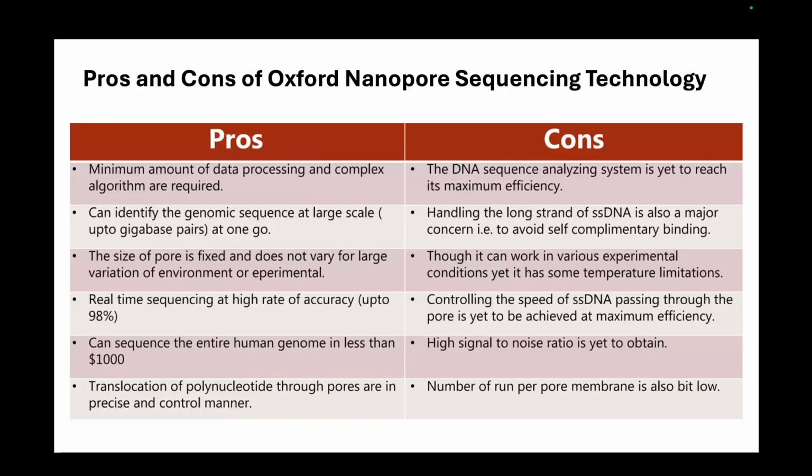You will see that in future classes as well when you're trying to analyze what is different in your genome: the variants, the mutations, the big variants. These kinds of things inside the genome are very hard to do with a short read length. The bigger your read, the better it is. So it's a trade-off, but I'll happily take a bigger read with these cons. But as I said, it's a little bit more expensive than Illumina, so Illumina is still quite widely used in the majority of groups. In my lab as well, we have an Illumina sequencer here.